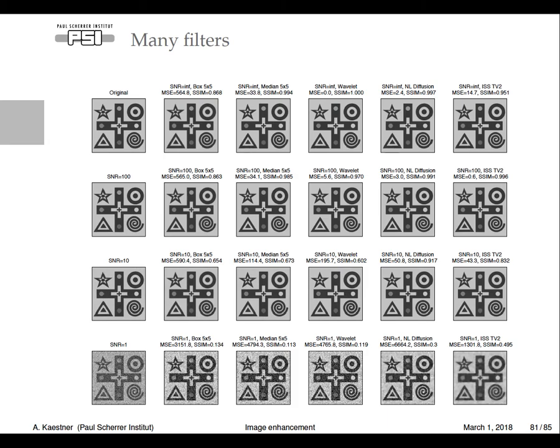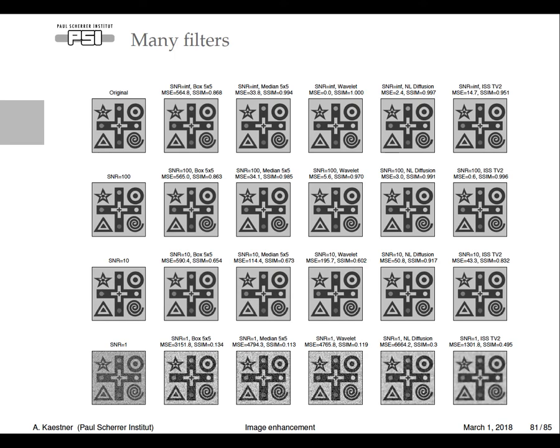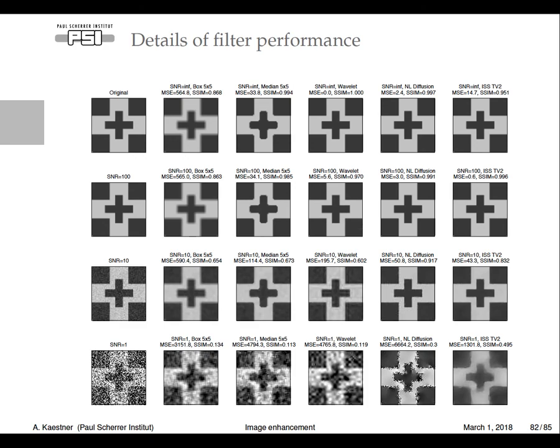And you can see how the different filters behave. The convolution and median filters down here still have a lot of noise effects in them. But if you come to those two filter types, then we start getting pretty nice results still. These are just plain geometric structures, so it's of course a very synthetic case, but it still demonstrates a little bit what it looks like. And now for the next slide, I focus on the little area around the middle cross, to see what happens with these different filters and how they behave.